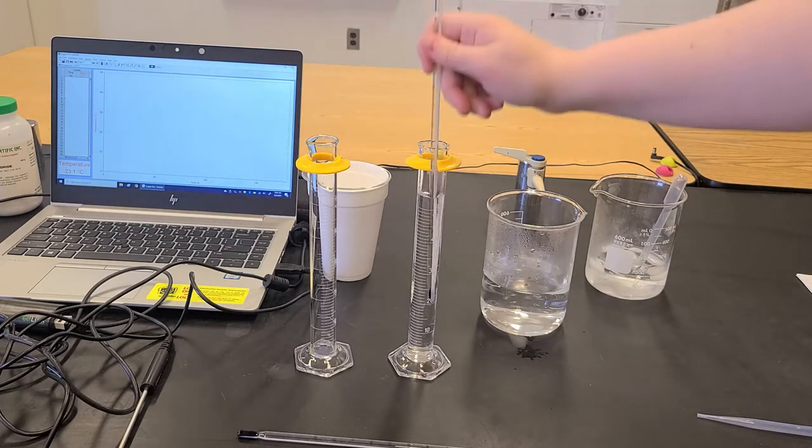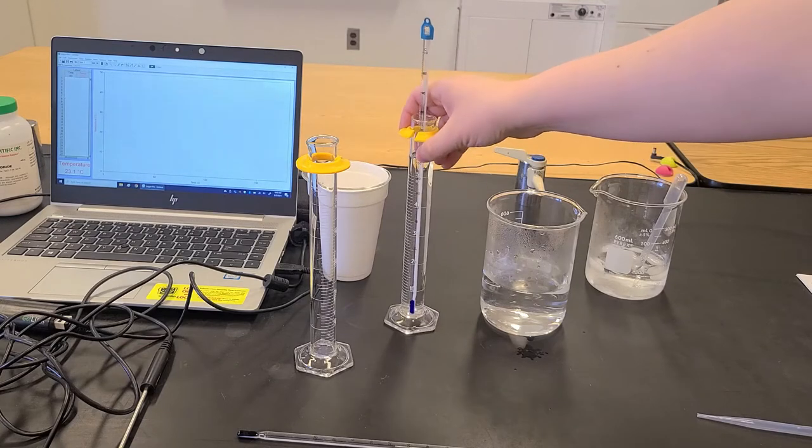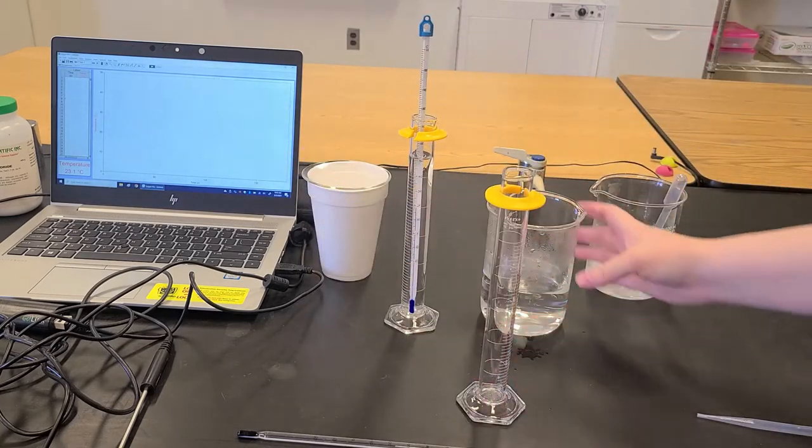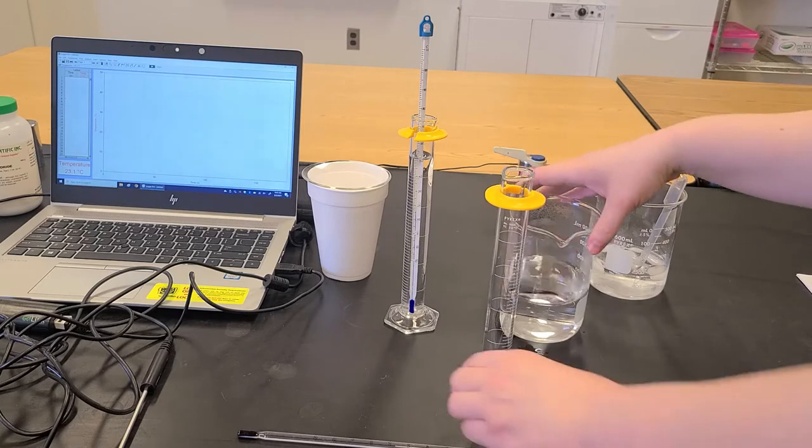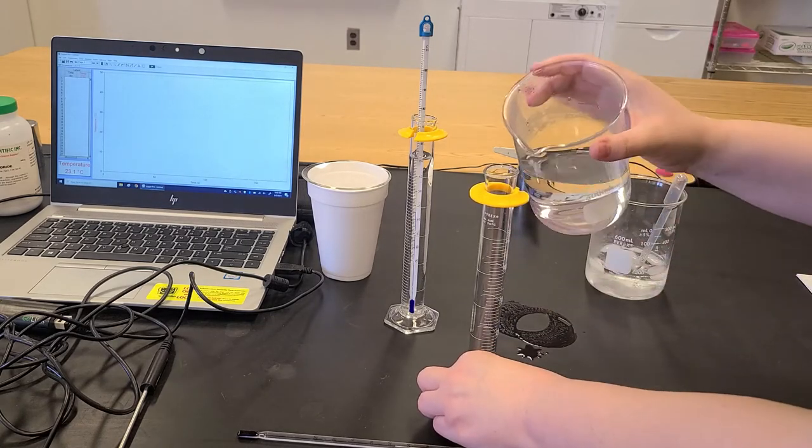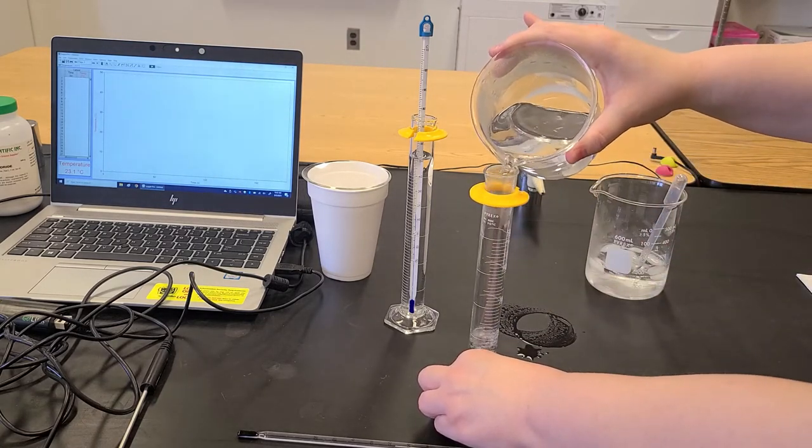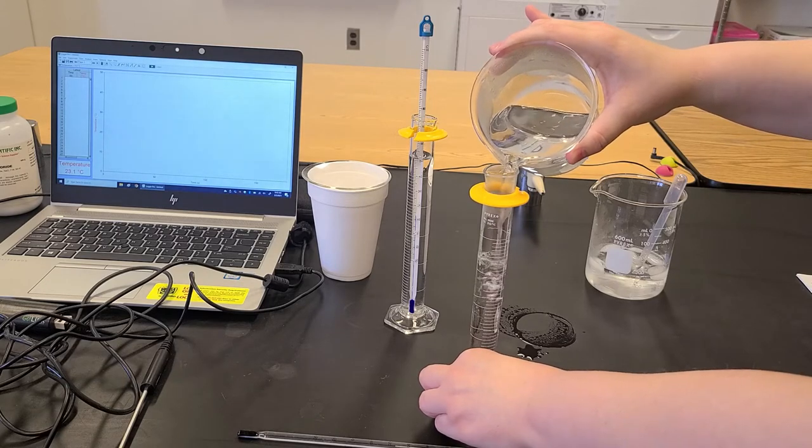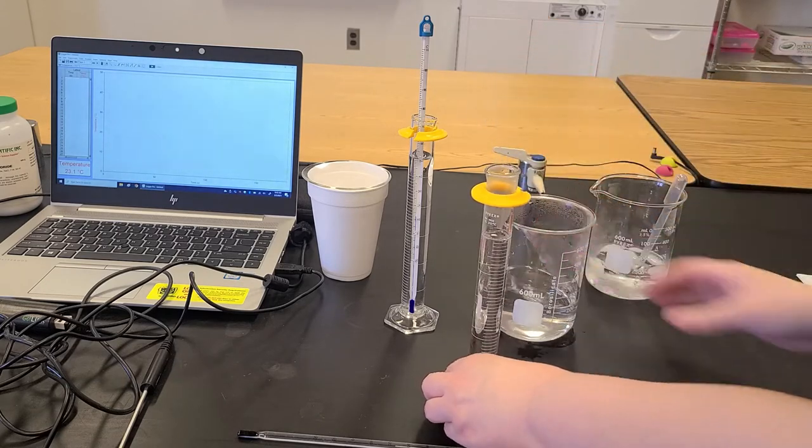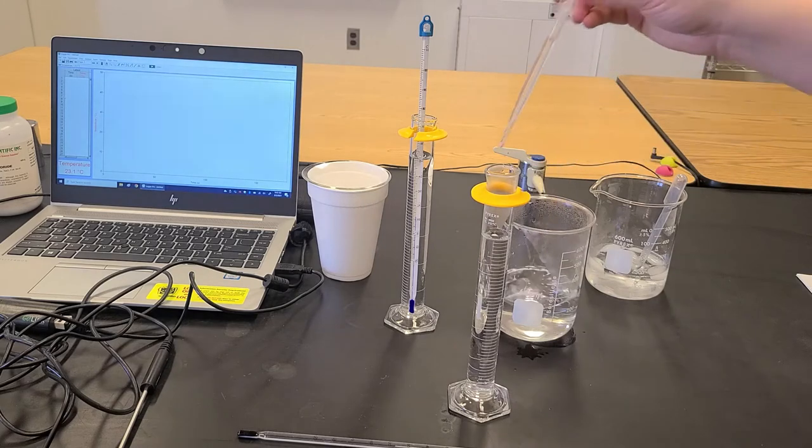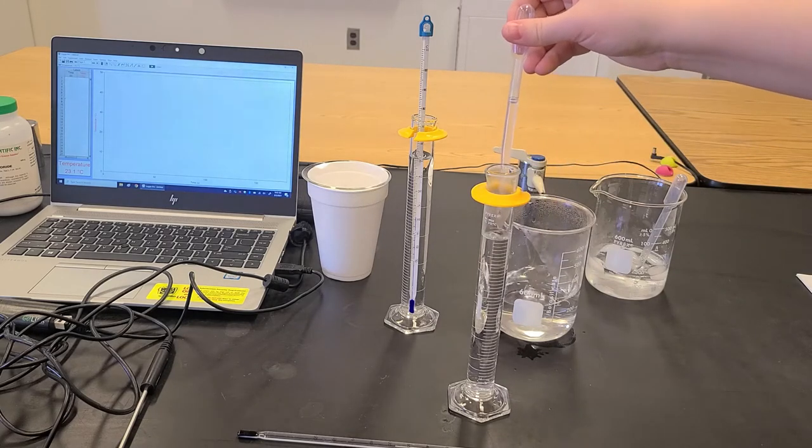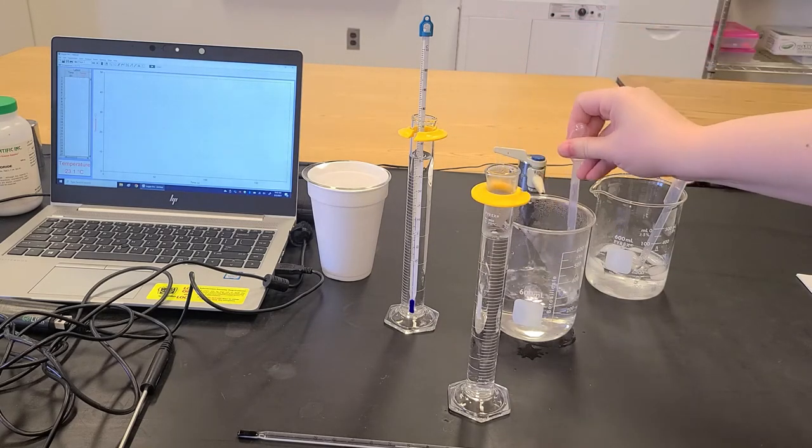And I need to know the starting temperature of my water. So now I'm going to pour out a 100 milliliter sample of hot water. I'm going to go ahead and adjust that volume to be exactly 100 milliliters.